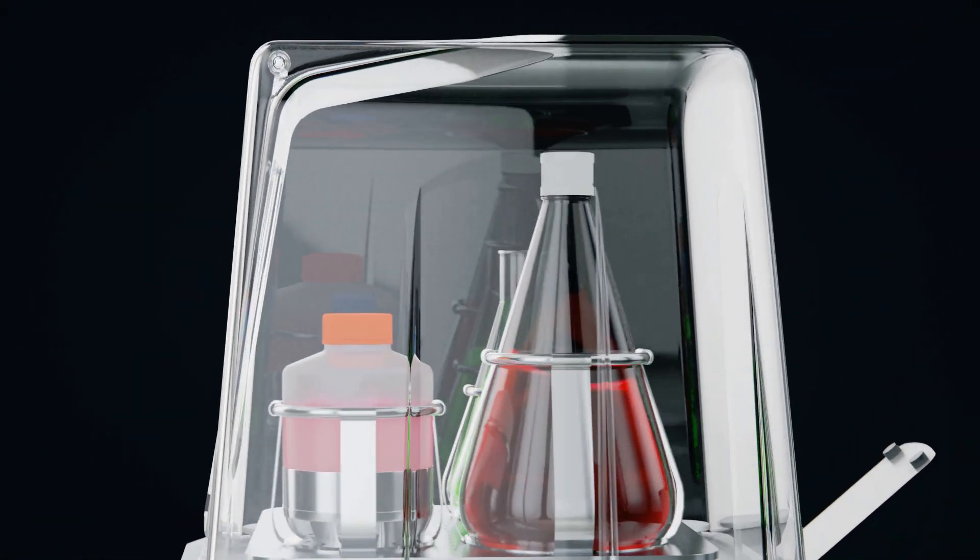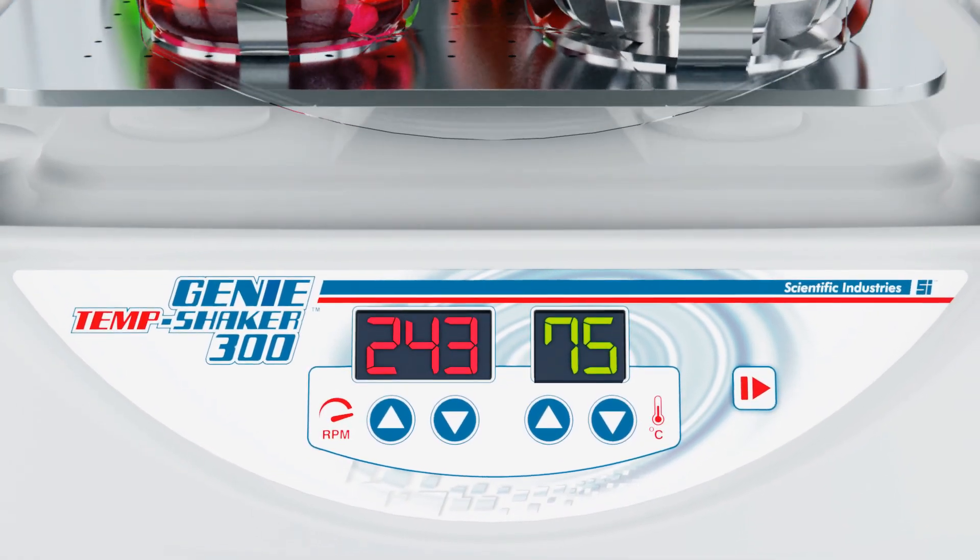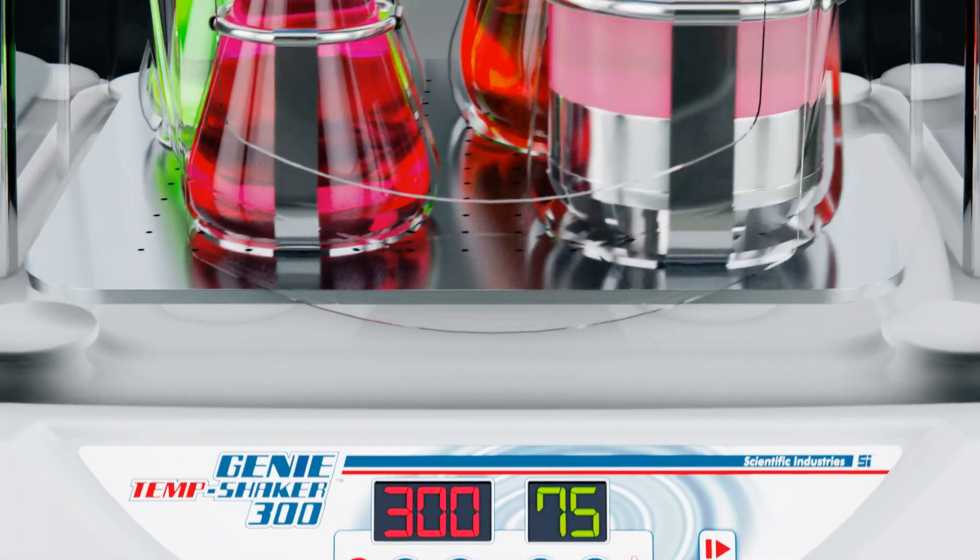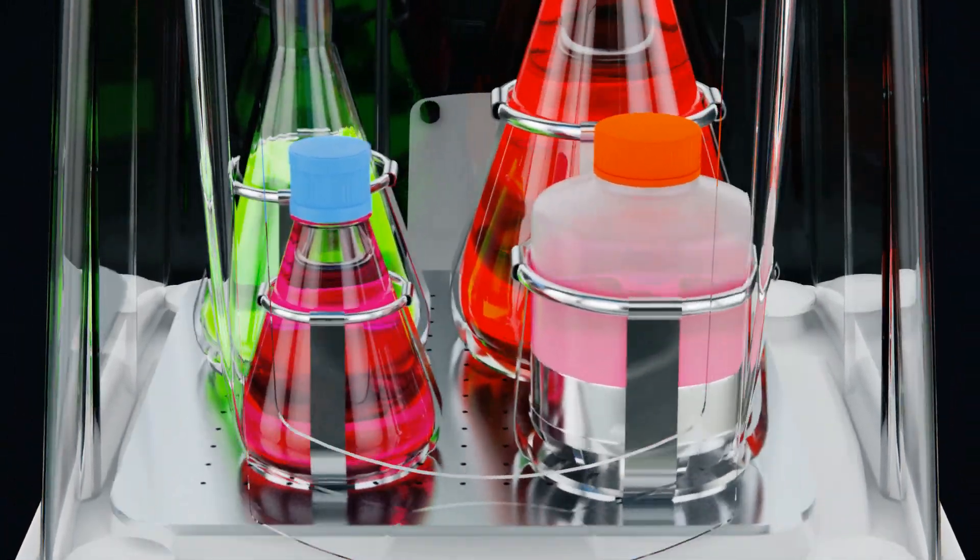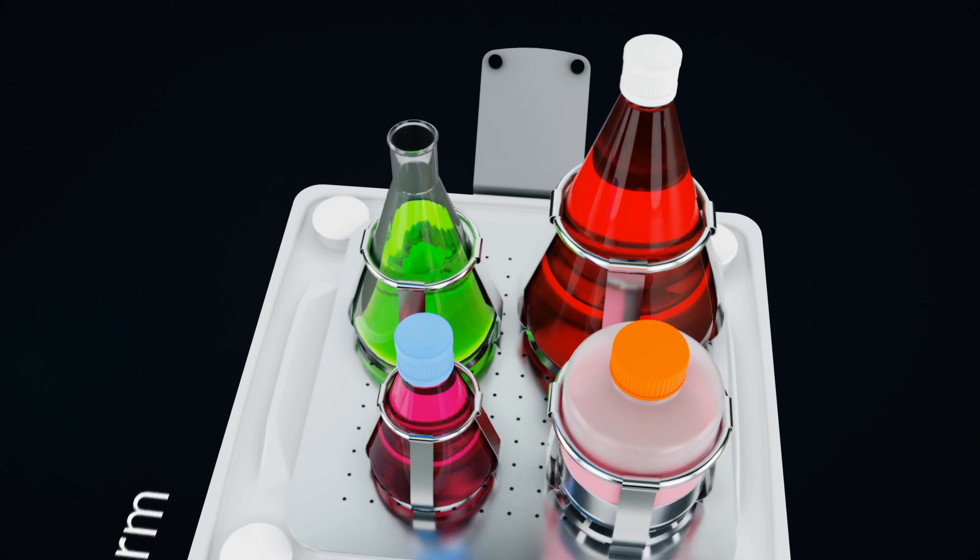It's not only powerful but also versatile. With a maximum speed of 300 rotations per minute and interchangeable platforms, the GTS 300 is one of the most adaptable orbital temperature shakers on the market.